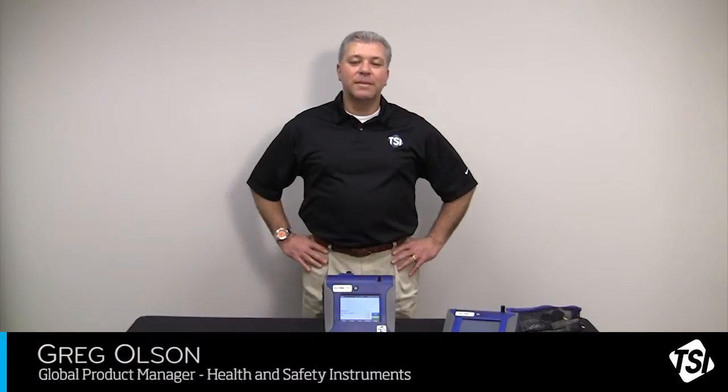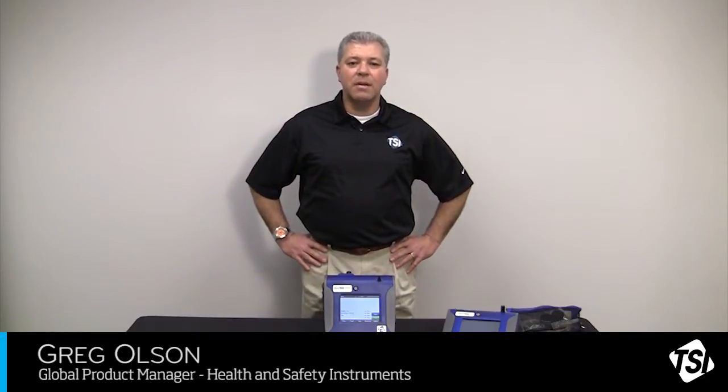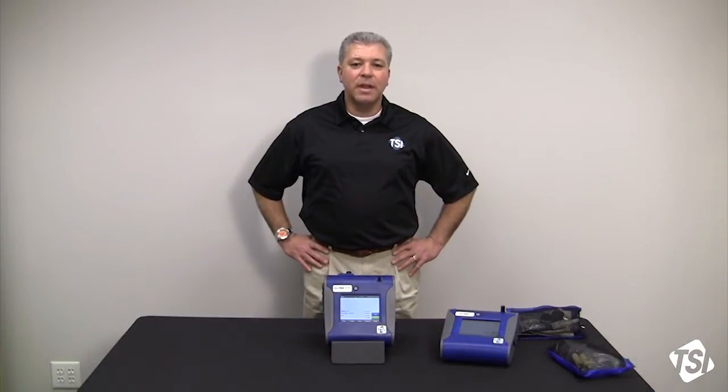Hi, this is Greg Olson with TSI. I'm TSI's industrial hygienist and the global product manager for the health and safety line of instruments. Today we're going to be going through a DustTrak setup — basically doing a quick rundown on identifying the components, setting up a DustTrak, and turning it on.